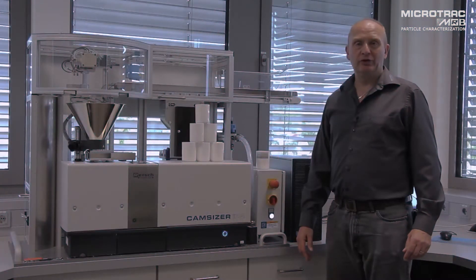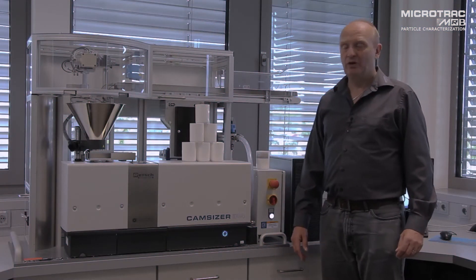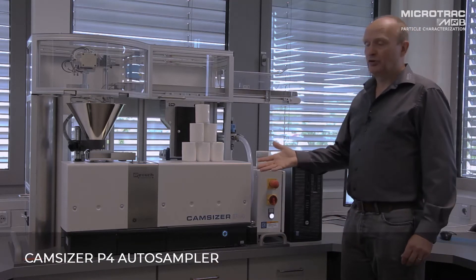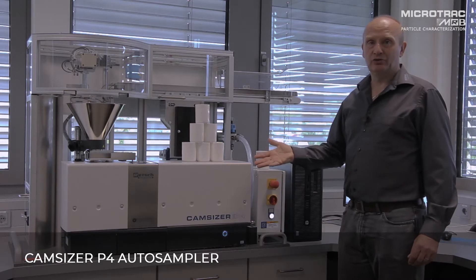Good morning, my name is Andy Wynne, I'm the Business Manager for Retsch Technology in the UK. I'd like to introduce you today to the Auto Sampler for the CamSizer P4 Dynamic Imaging System.